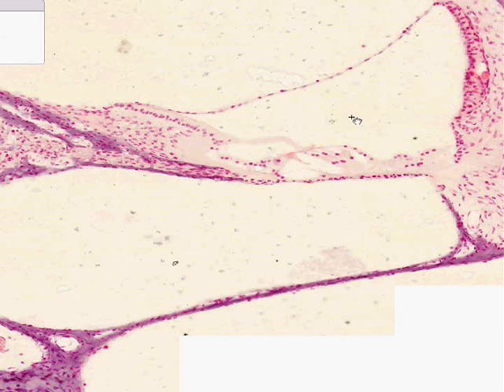The tectorial membrane basically makes contact with a series of cells here. The three cells towards the end of this tectorial membrane, which is not perfectly in place, are the three outer hair cells. There will also be another hair cell more proximal to the base of the tectorial membrane called the single inner hair cell. So you have three outer hair cells and one inner hair cell.